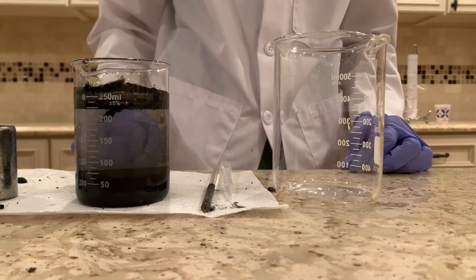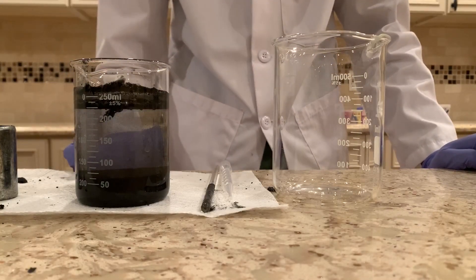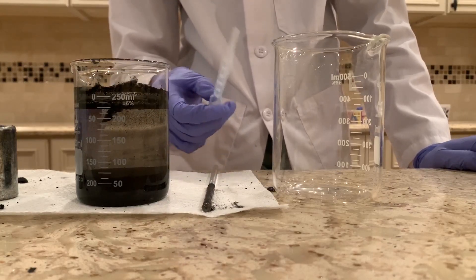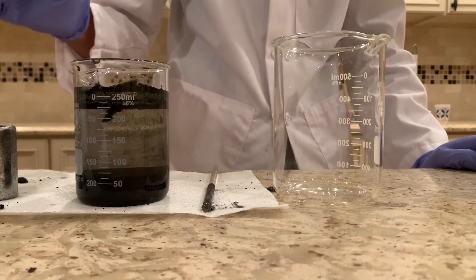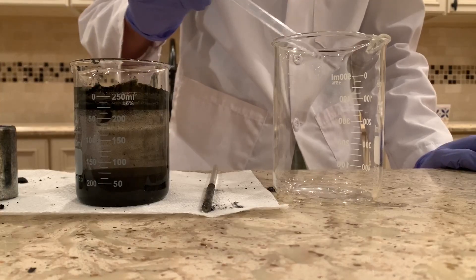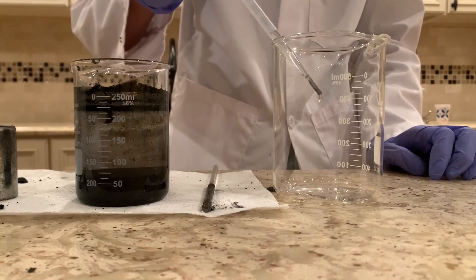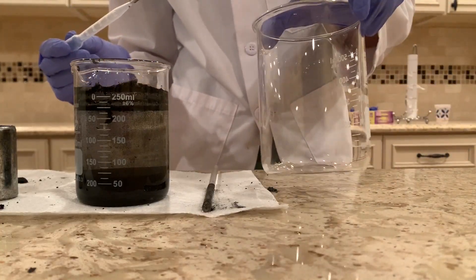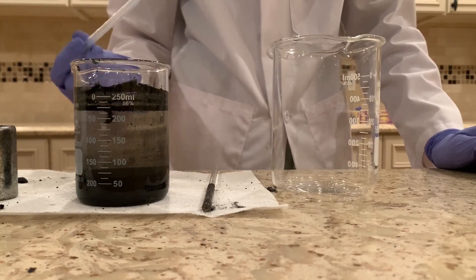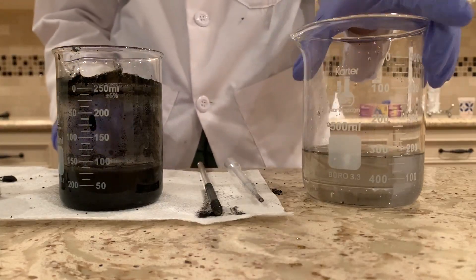I let this solution sit overnight and now we can see there are clearly two layers that have formed: one darkish black layer at the bottom showing the manganese dioxide separated out, and a clear layer at the top which we'll separate using a pipette. The water coming out is almost completely clear, showing we're leaving most of the manganese dioxide in the beaker. Now I'm going to get the rest of the water into this beaker — we have some pretty clear water.